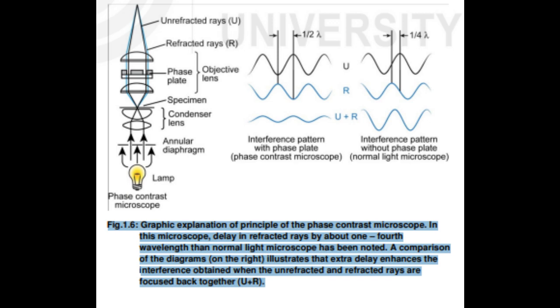This type of microscopy was developed by British microscopist Francis Smith and French physicist Maurice Françon in 1947. Quartz lenses were used by them to produce two beams of light that were perpendicularly polarized.